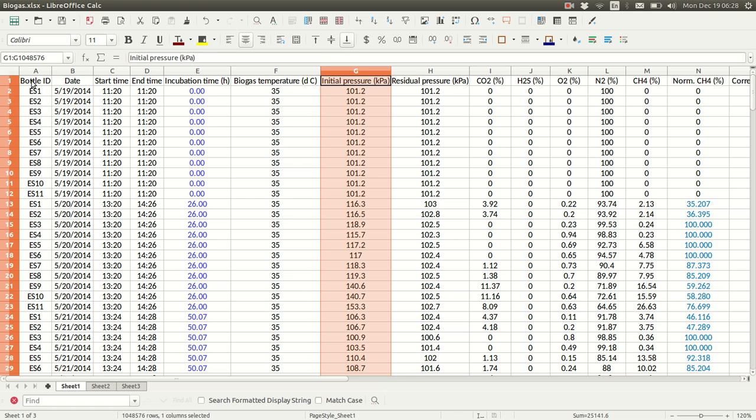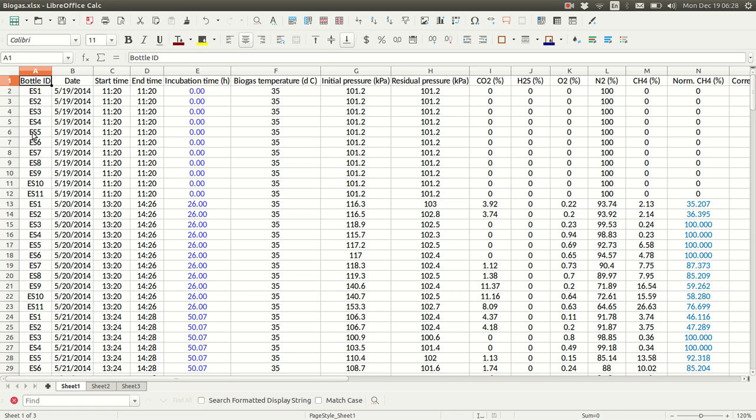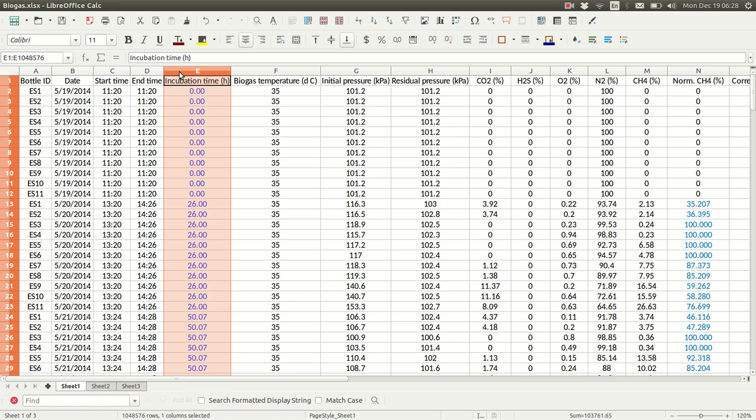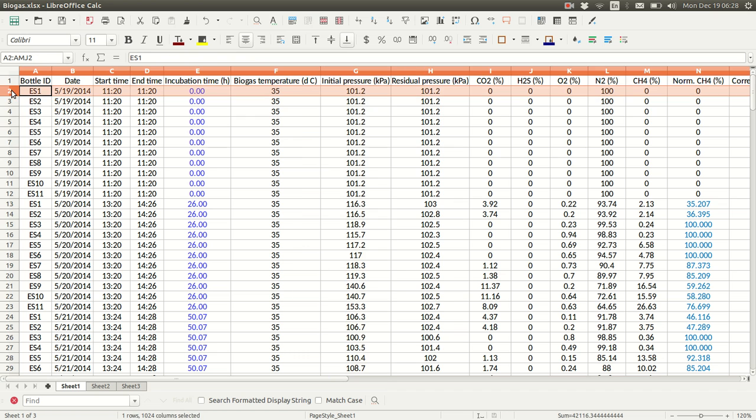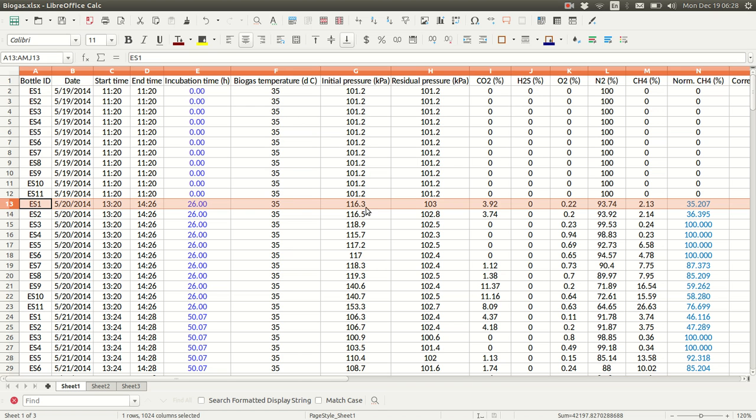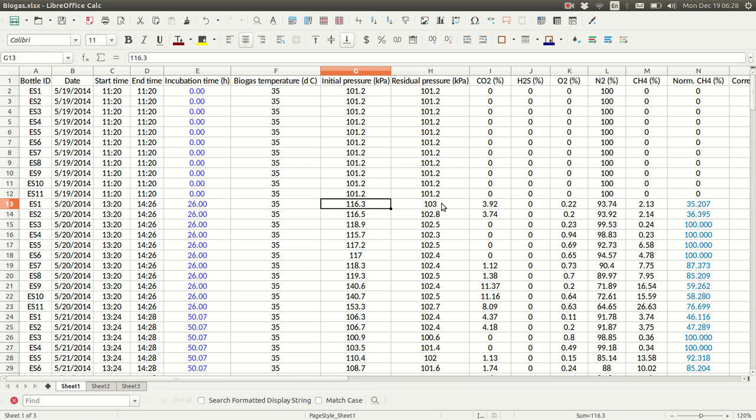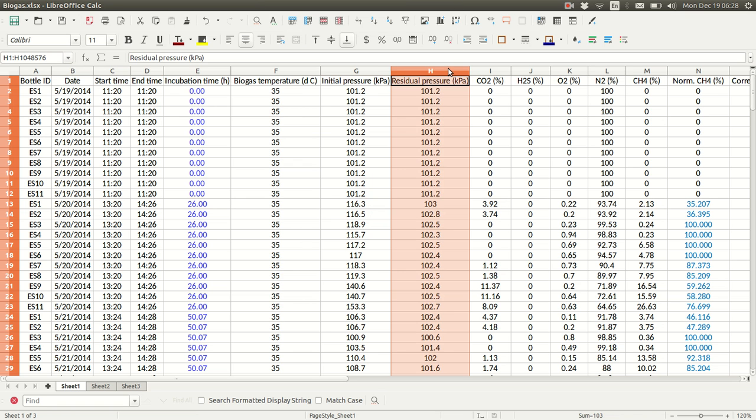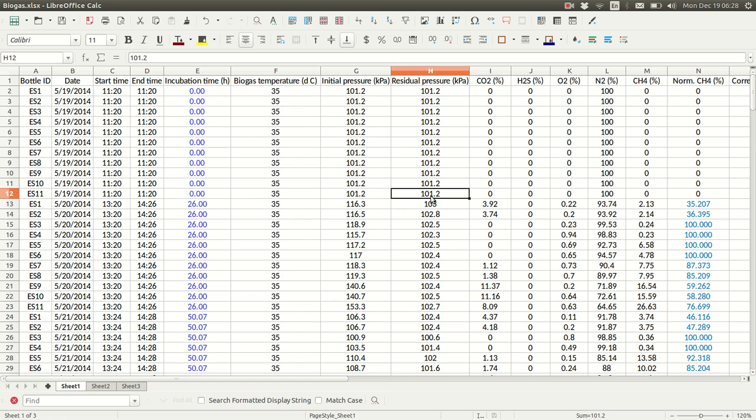This bottle ID column is essential. It can be named anything, but it has to have a unique code for each bottle. And then we need incubation time and headspace pressure. Here these first twelve or eleven rows have the initial pressure. After that, here we have pressure at the end of one day, headspace pressure before, and then after venting. This column's optional, but it's nice to have if residual pressure varies significantly.